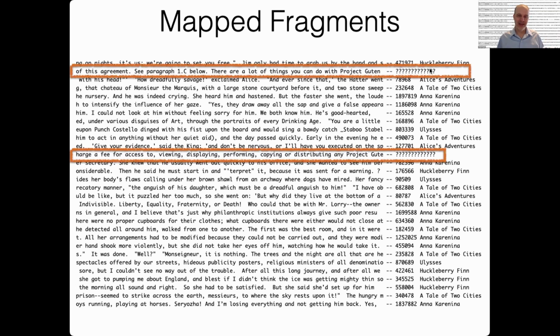So we get this with real RNA-seq data, and there are different ways of handling this, but one is just to say, okay, we're going to ignore this because we can't get any useful information out of it.